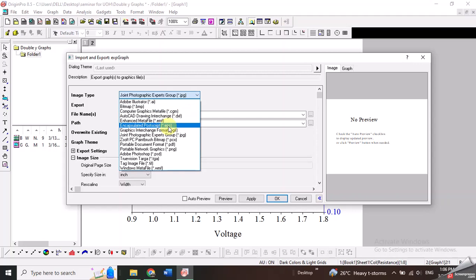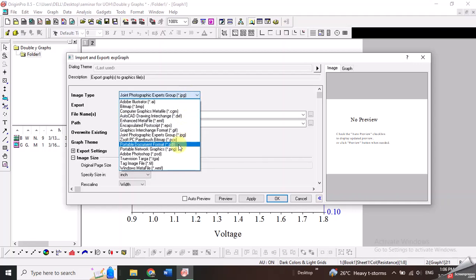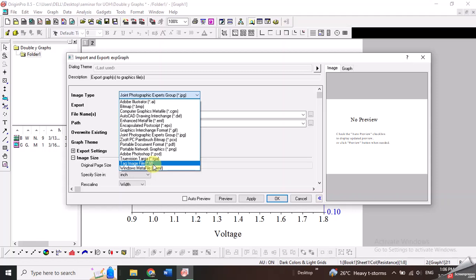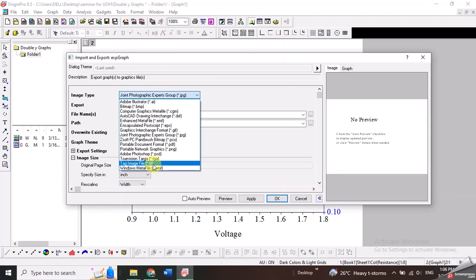So you need to make sure that you have selected JPG or PNG or maybe TIF. I will prefer JPG because it will give you a very good high resolution image.